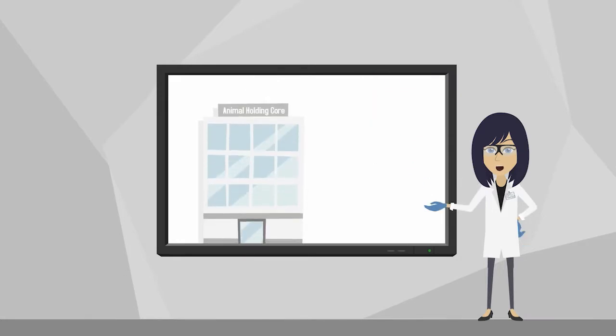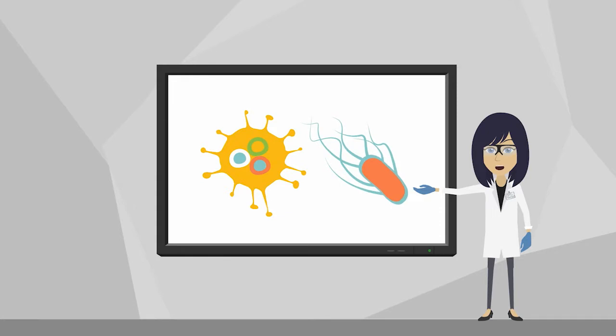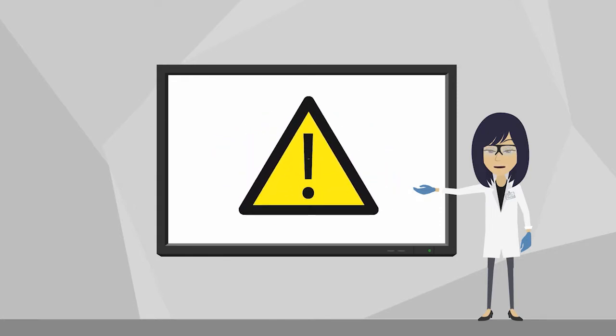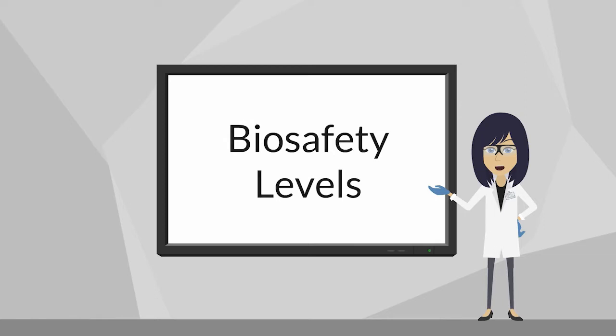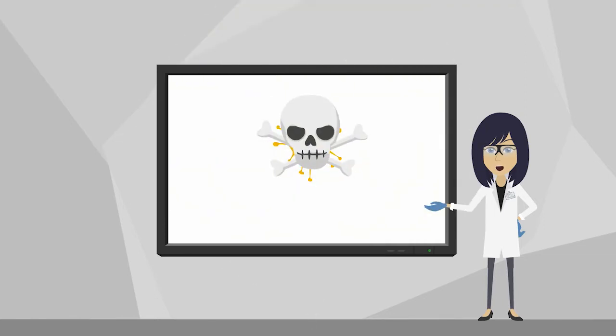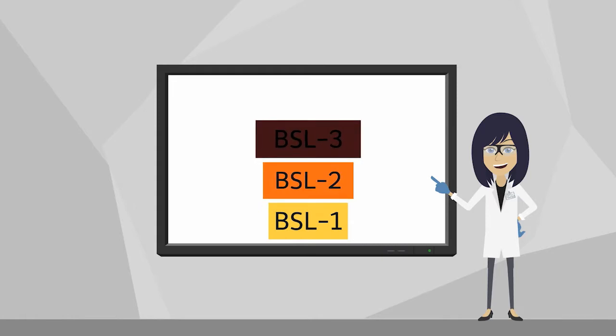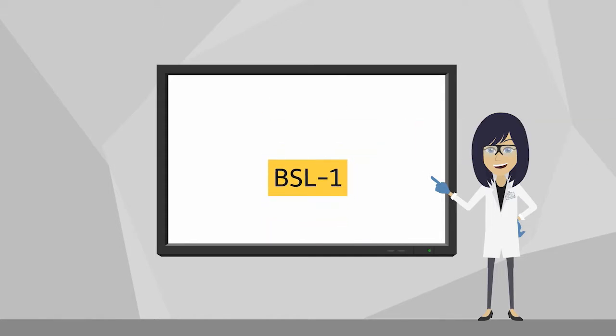When entering the animal holding core labs, you need to wear a lab coat, gloves, hairnet, face mask and shoe cover. The organism you are working with or exposed to will determine the proper safety precautions to take. These are designated different biosafety levels, BSL. The more pathogenic the agent, the more stringent the safety precautions are. There are 4 categories of biosafety level in increasing order of risk. The Lo Kui Siang Integrated Biomedical Sciences building can only handle the first 2 levels.